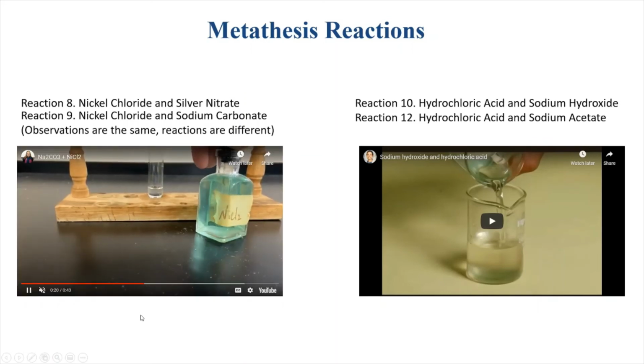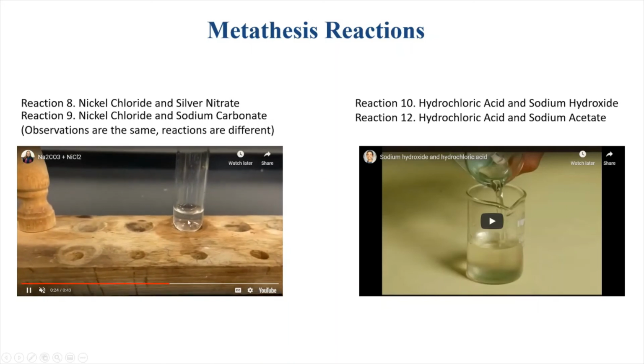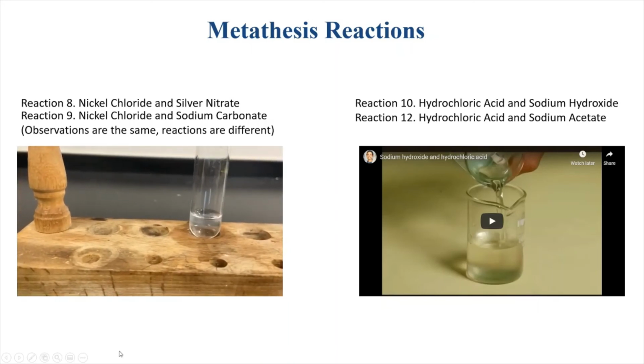Okay, so let's take a look at this video. In this test tube we have sodium carbonate, and we're going to add the nickel chloride to it. So this one is reaction 9.